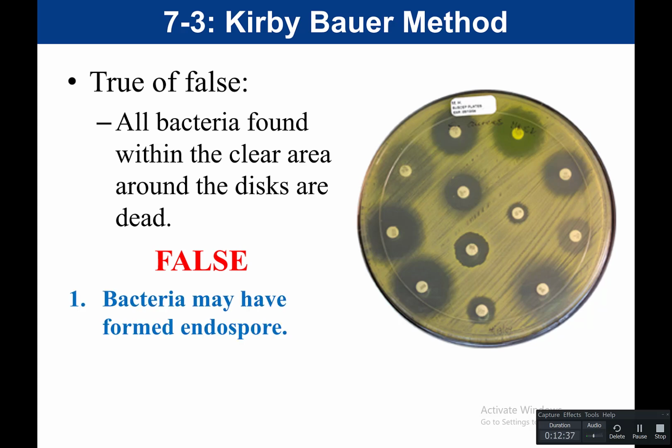Reason number one, bacteria may have formed endospores, right? Remember that in response to a harsh condition, bacteria can form endospores. So when challenged with the drug, the bacteria may have formed endospores in this region, and they may be inhibited, right? They might not be growing, but they're not in fact dead. They could still germinate if the drug was removed. So reason number one is that bacteria may have formed endospores.